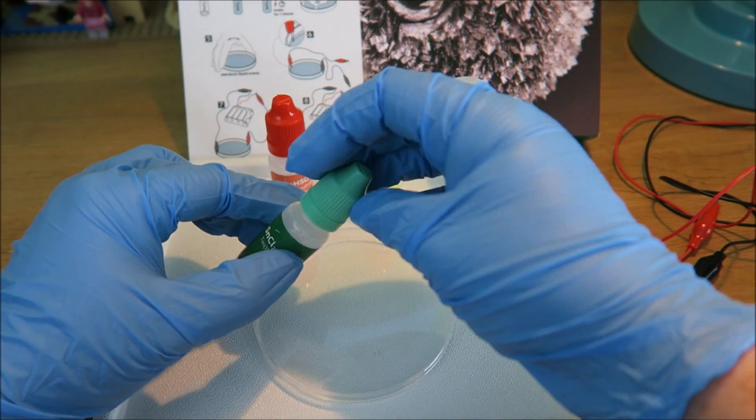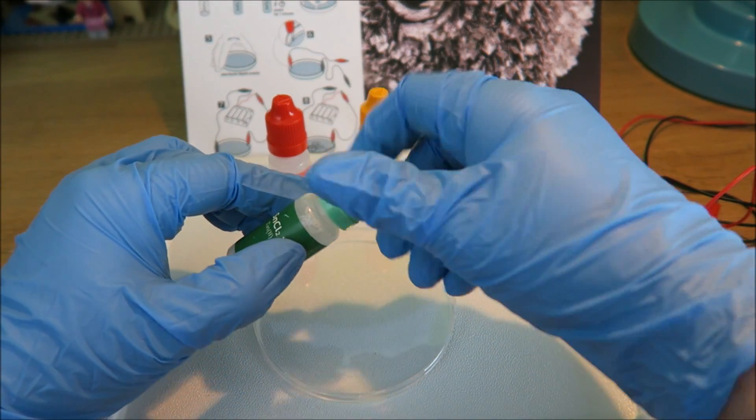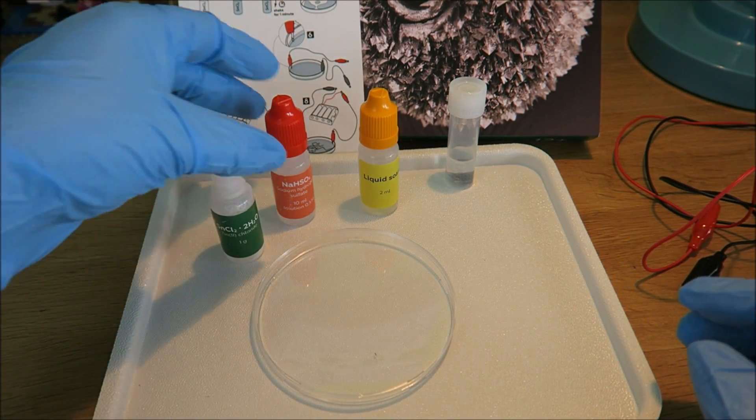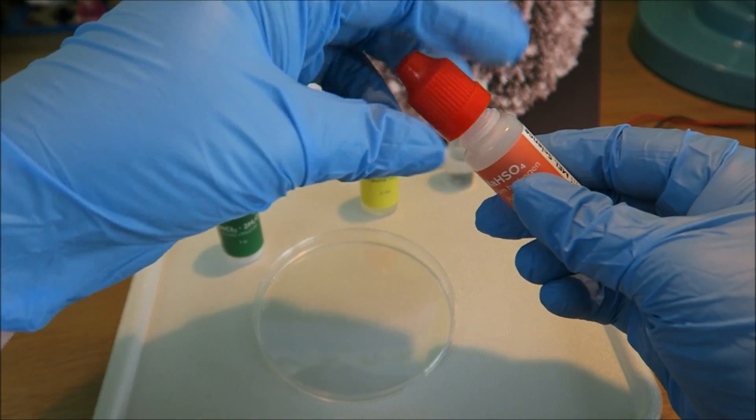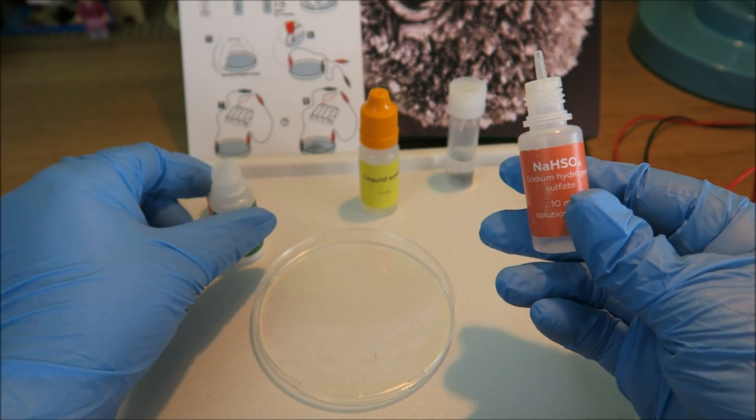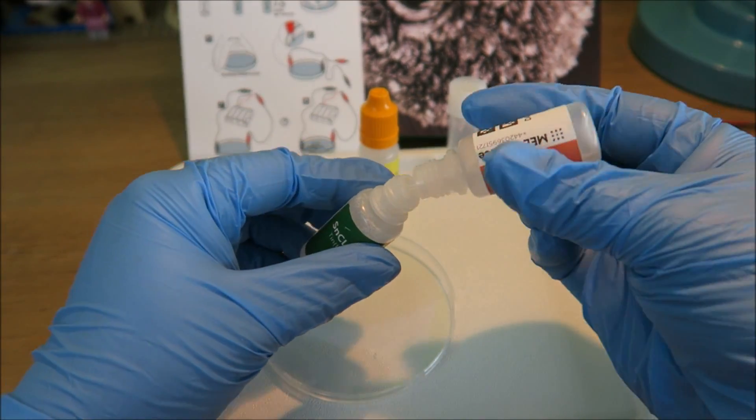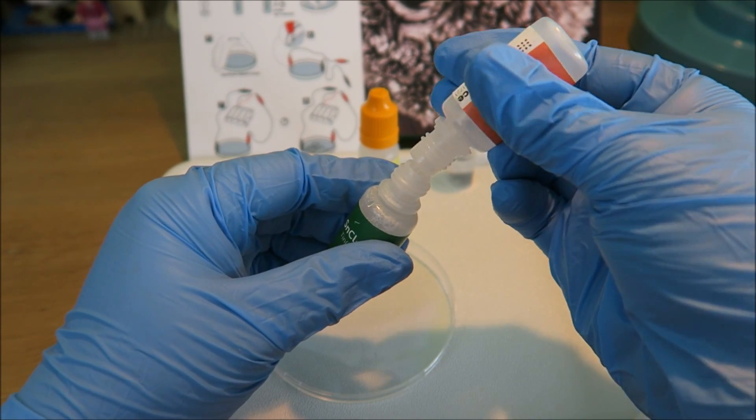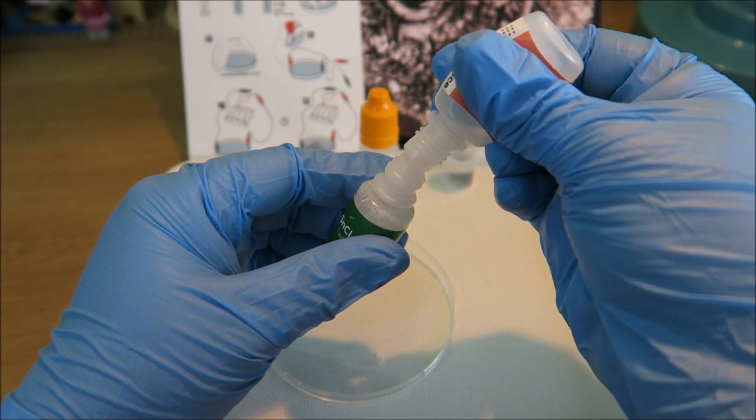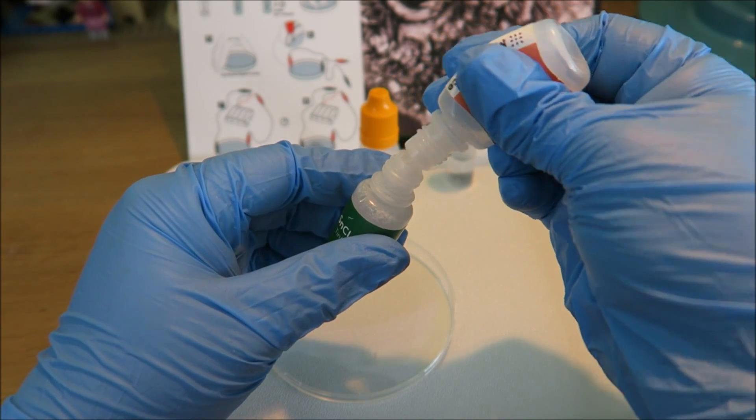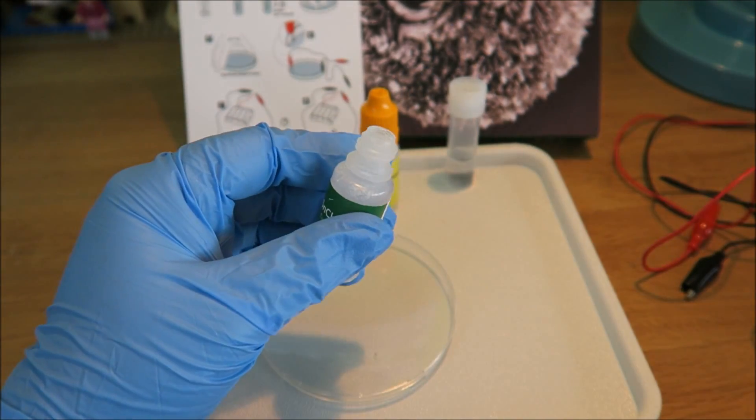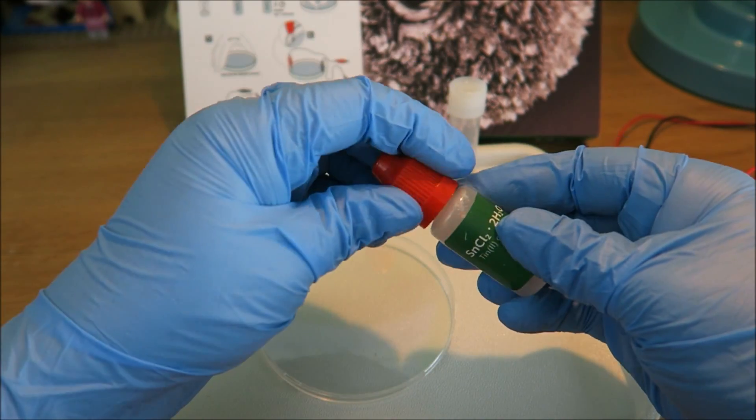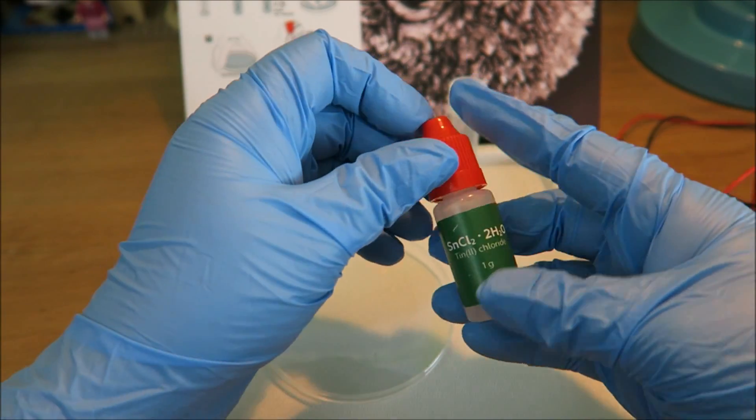The lid comes off the tin chloride and then we can throw away the blue cap because we don't need that anymore. The lid comes off the sodium hydrogen sulphate. All of that goes in there. We don't need that bottle anymore and we need to put the red lid on the green bottle and shake.